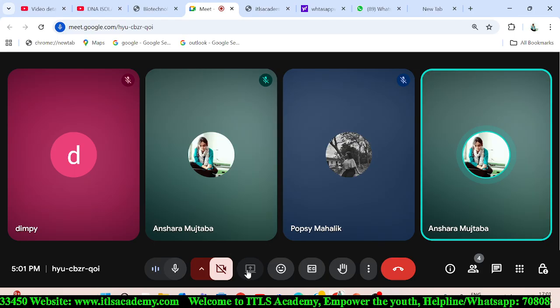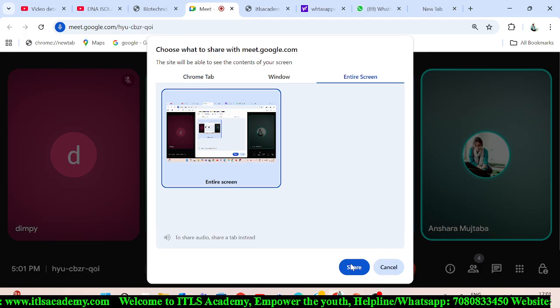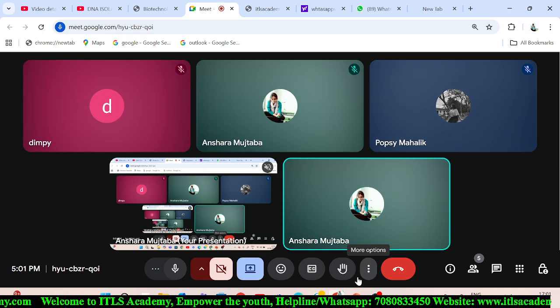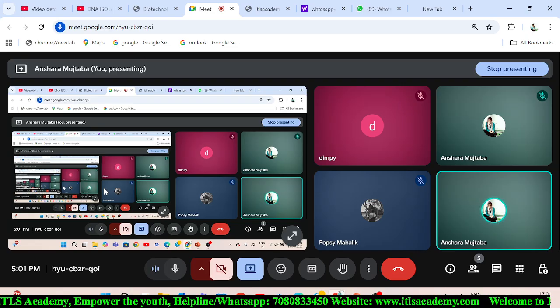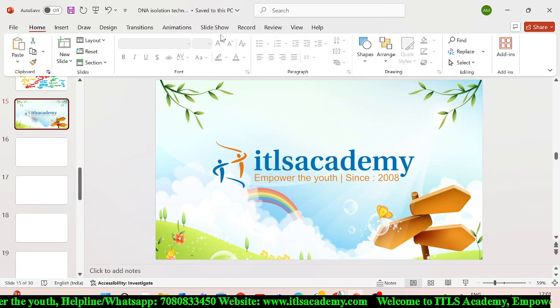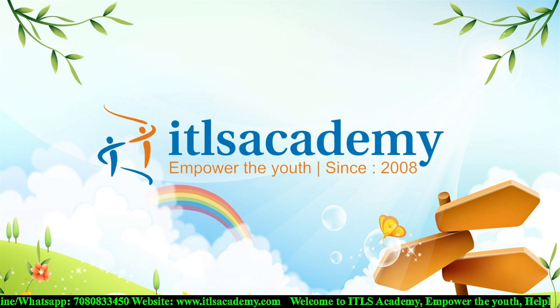Okay. Now I'm going to share my screen with you, then after that, I will explain. First of all, I will discuss one topic, then show the experimental video related to this. Then after that, I will explain another topic, right? Now, the first topic is the isolation of the DNA from the bacterial cell.